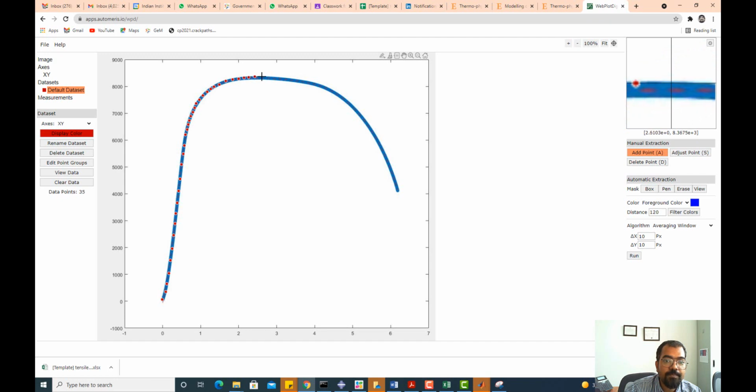And actually the better option would be to use SigmaPlot software, but you can also use some of the coding to decrease the data just like that. So you can just say that next n terms are 0.